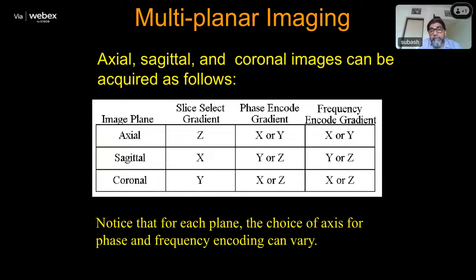And one thing I want to make clear is that these three gradients are exactly identical. There's no difference in the design. Their orientation is different, but otherwise they have the same capability all throughout.